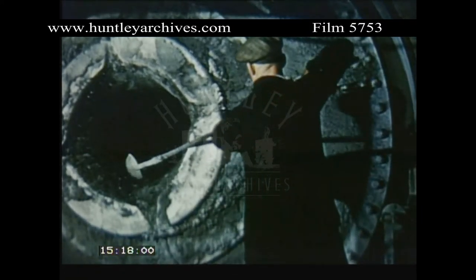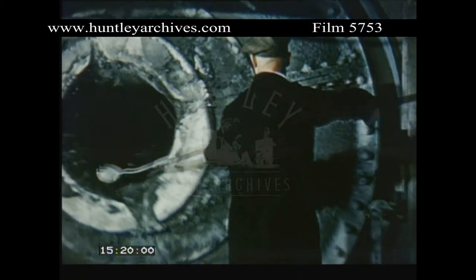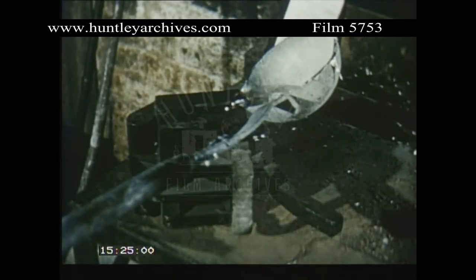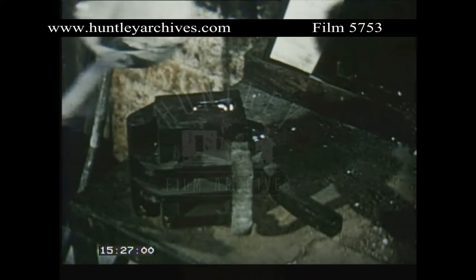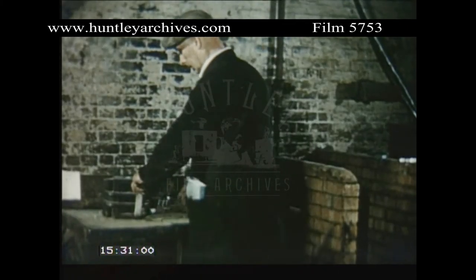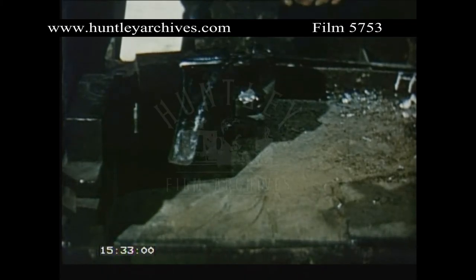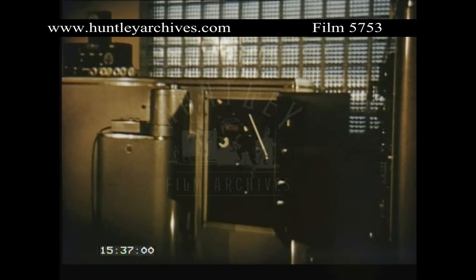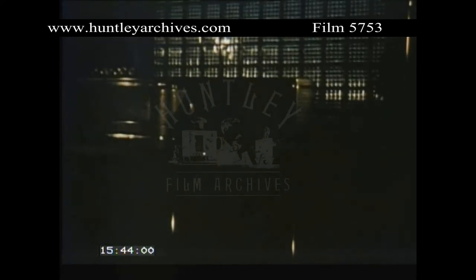In foundries, where there are many different types of alloy in continuous production, it is an enormous saving of time and material to analyze the melt before it is poured. A small sample is cast and taken to the laboratory for analysis. In the direct reading spectrograph, the photographic process has been eliminated, and quantitative analysis is done automatically by photocells.